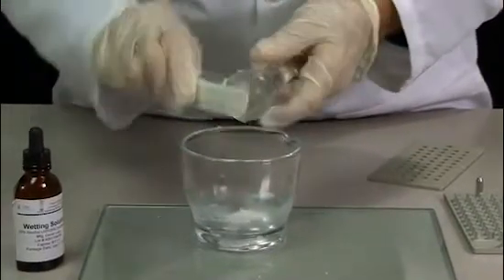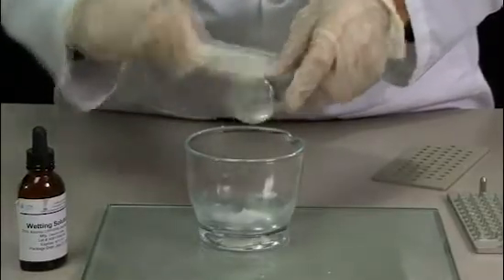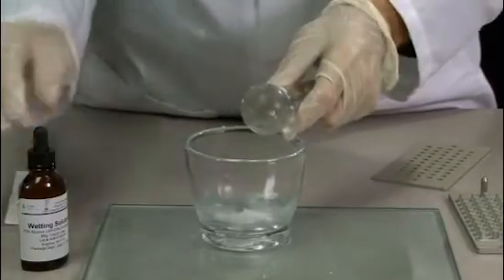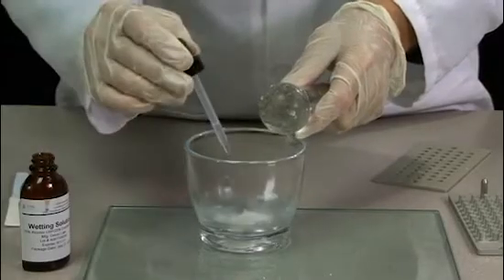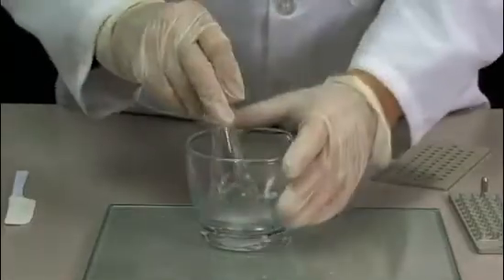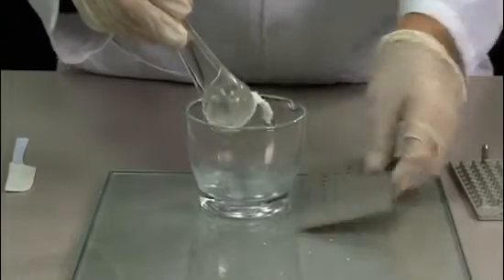At this point, add 3 more drops of the wetting solution. Triturate lightly and transfer the mass to the cavity plate.